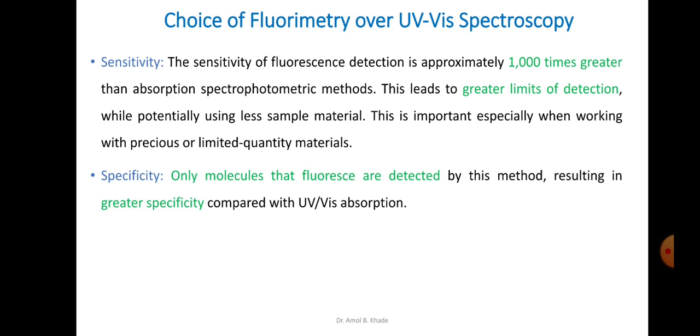So you can imagine you have one sample which you are estimating or quantifying with UV visible spectroscopy. The same sample is capable of producing fluorescence, so you are estimating it with fluorimetry or fluorescence spectroscopy. So your main analyte is fluorescent in nature, right? So if you are analyzing with UV visible spectroscopy, along with that analyte, if some other impurities are there which are also absorbing the light, then they will also contribute to the final absorbance.